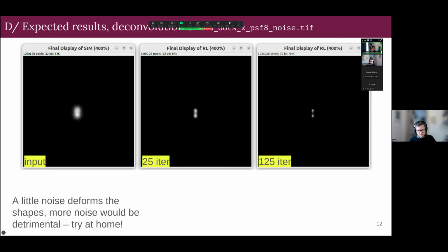In all these cases, you have had the true answer all the time. But with your data, you don't really know, unless you have super resolution images to compare with. So be careful to draw too many conclusions from the deconvolution, unless you have the PSF under total control.